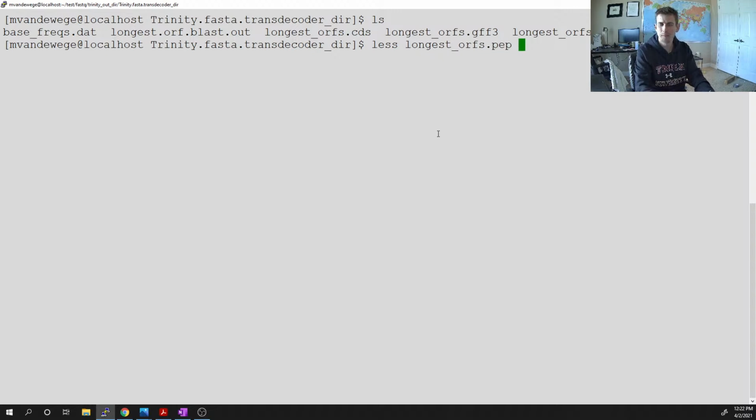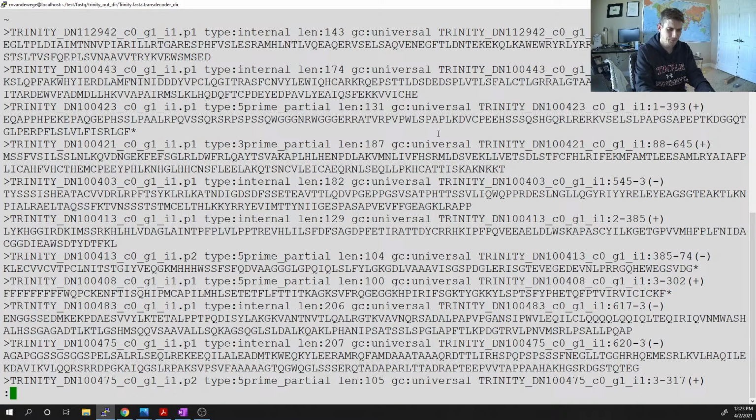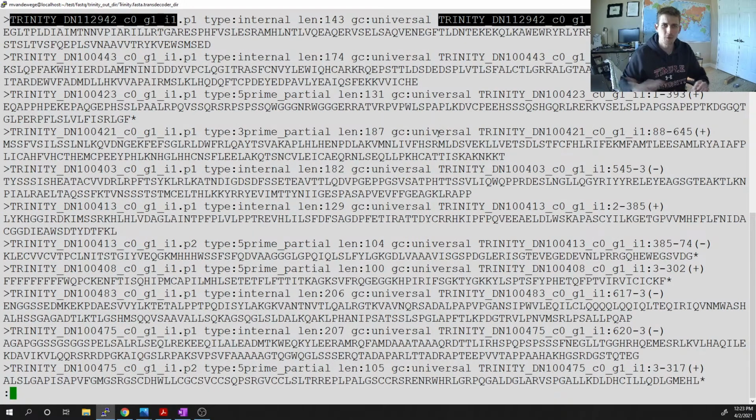I'm just going to look in the PEP for this gene. Okay, so here's our transcripts. It's internal, but nonetheless, we at least want to know what this is. And so we can use two things to figure out what it is, and it's basically a comparison search.